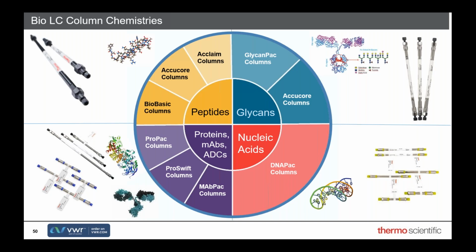This is important where you've got really complex glycans that are heavily sialylated. It'll pull the sialylations out into groups, one sialylation, 2, 3, 4, and then it gives you the different composition inside those groups. So you can get much more separation power on complex glycans with these glycan mixed mode columns.